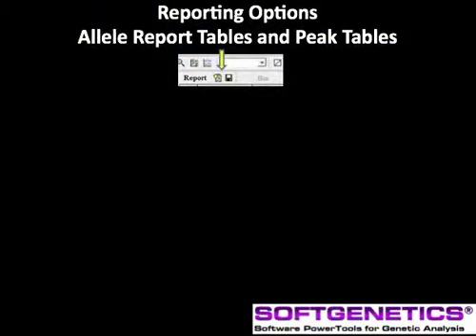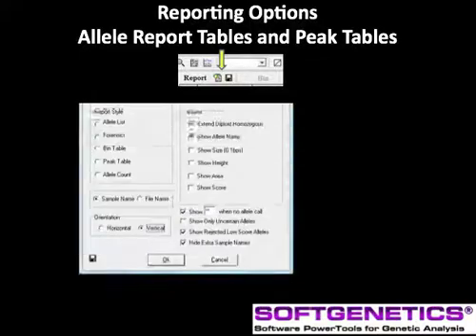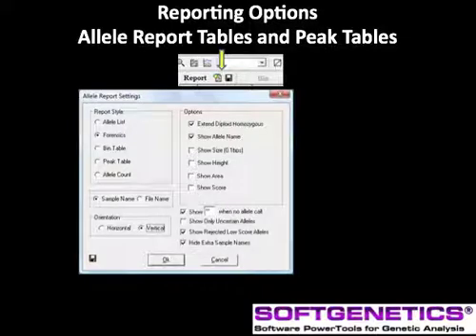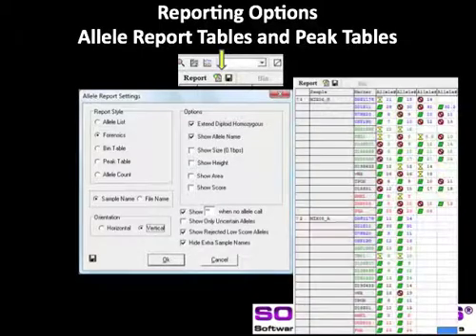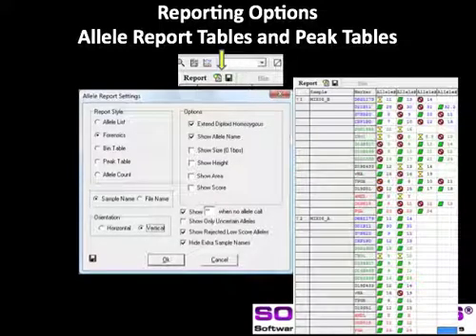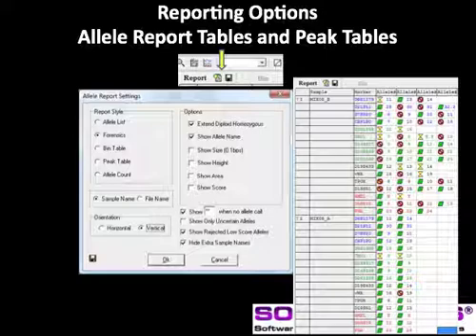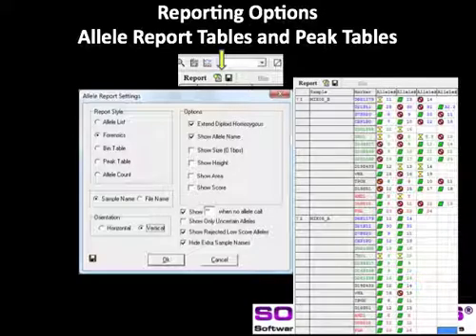Reporting options also include report tables and peak tables. Activate the allele report settings using the report icon in the upper right side of the main analysis screen. Select from the report style and other options to customize the report for your lab's preference. These report settings result in an allele report table listing the file name, loci, and allele calls. Use the save icon to save the table as an XLS or text file.